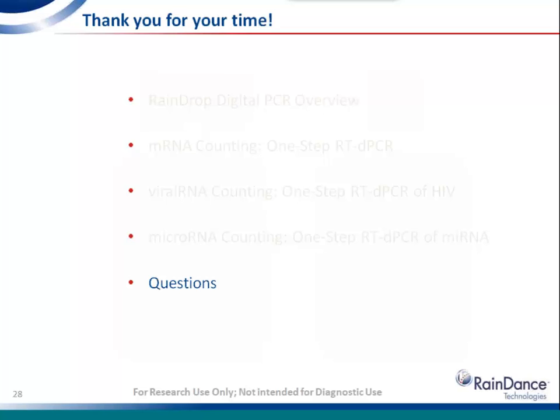What are the 4 one-step RT kits you mentioned you tested? That's a great question. There really was not any prioritization or selection of that in any way. What I used were a couple of kits from Life Technologies. The one that I showed most of the data on was the standard SuperScript III Platinum Taq. But I also used kits from QIAGEN and from Quanta, and a second kit from Life Technologies as well, which is called AgPath. There was no kit that I tried that did not work. I just tried 4.